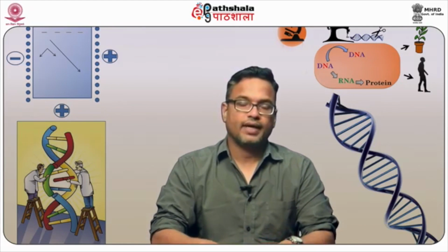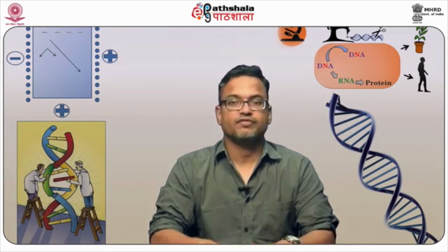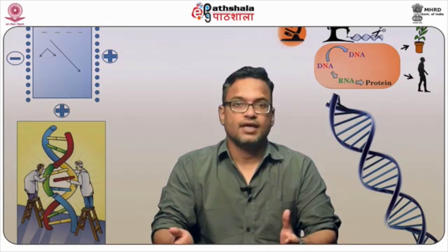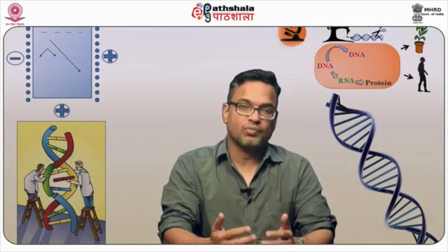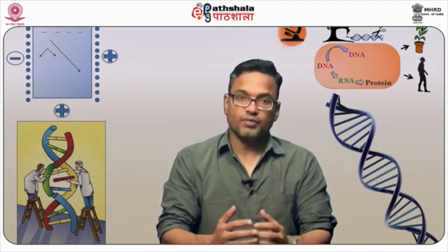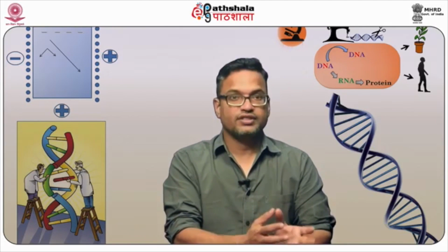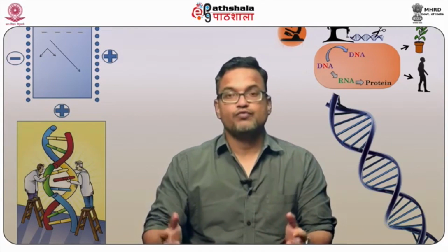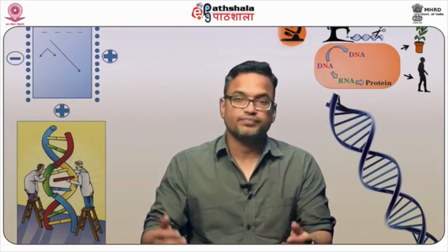So I hope the students have understood by the end of this module that the microscope has become a very integral part of research for biomedical or basic researchers, because of the range of applications it has. It has given researchers the potential to expand and to understand biological complexity by using this microscope tool. Microscopy, as you can see, has also evolved over the years. To begin with, the light sources were just natural light or the mercury lamp, and from there it has evolved up to the two-photon system, where we use just a very small amount of light to illuminate our sample to get a better resolution.